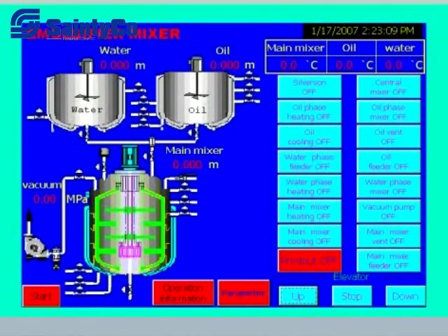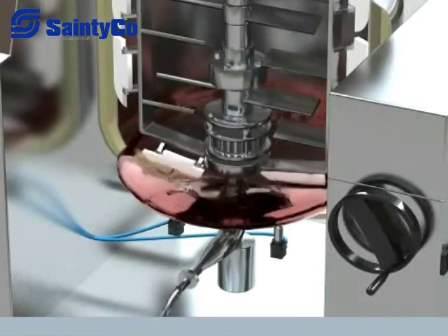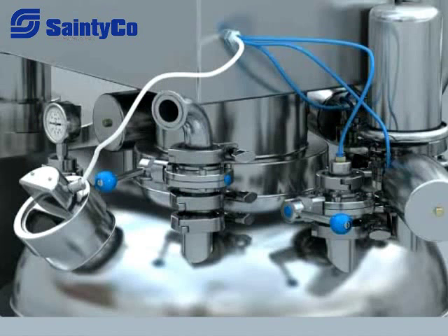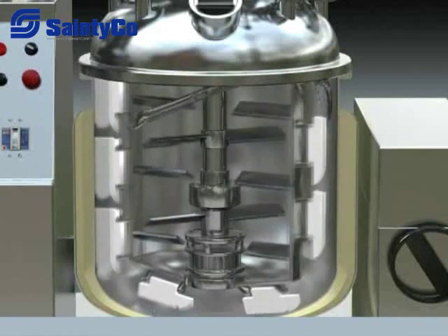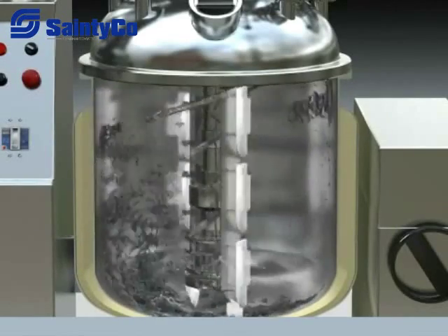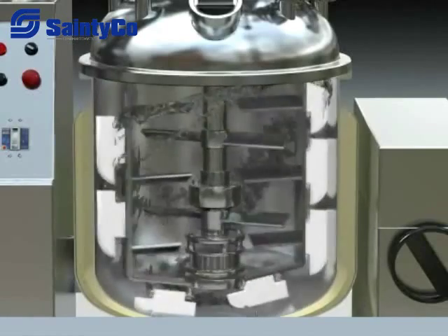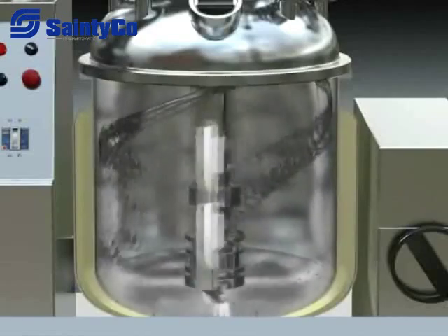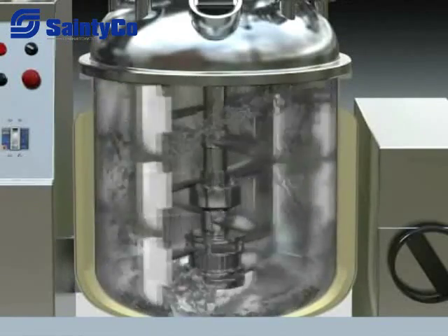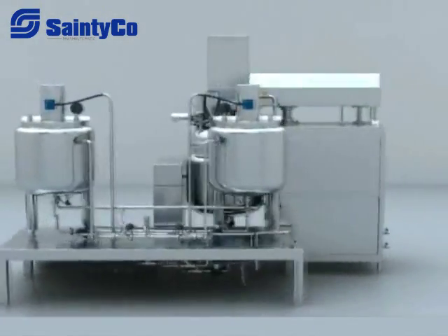11. Positive pressure discharge. Start the discharge thermostatic valve of the main tank and open the manual air valve; compressed air enters the main tank and material discharge begins. 12. Turn off all systems and enter the next procedure. Main tank cleaning technique: First connect 70–80°C hot water to the CIP of the main tank and open the CIP cleaning valve. The hot water will be sprayed in the tank; at the same time start low-speed mixing. When the water reaches one third of the tank level, start emulsifying mixing for two to three minutes. Then turn off all systems and open the bottom valve of the main tank to discharge waste water. After discharging waste water, lift the upper ceiling head up and open the upper lid of the main tank for manual cleaning. After emulsifier cleaning, make all spots dry and clean.